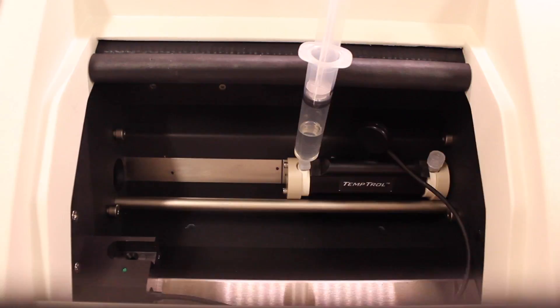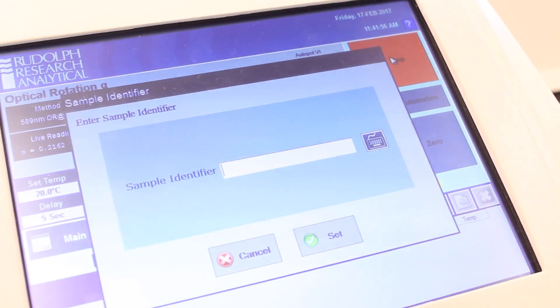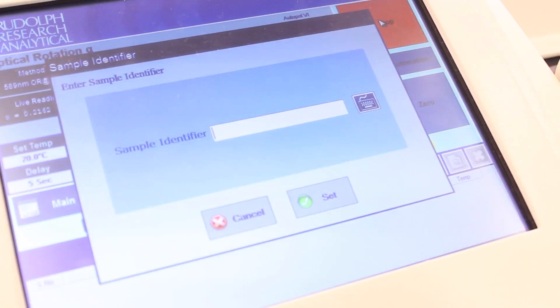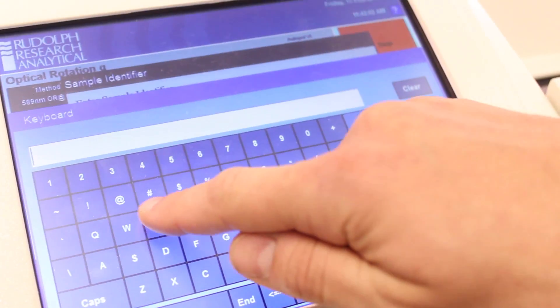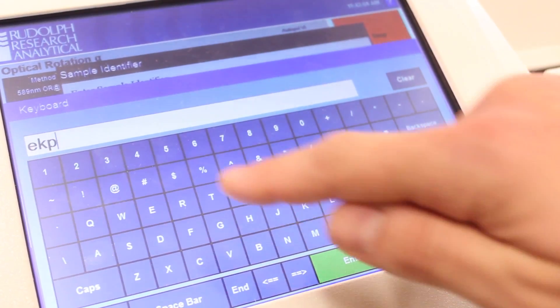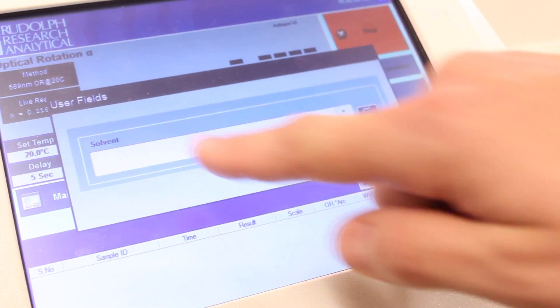Return the cell to its original position, close the door, and press start. You'll be prompted for a sample identifier — it's important that you enter your Yale NetID here, as this is one of the ways we keep track of polarimeter usage. You may also be prompted for other information, but you can skip entering these items if you wish.